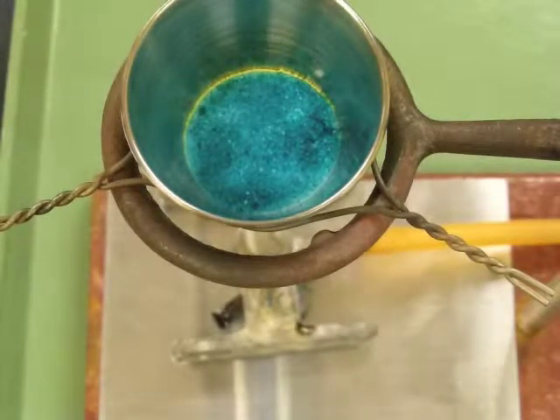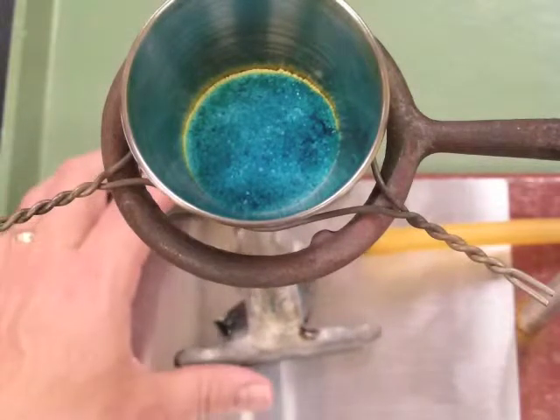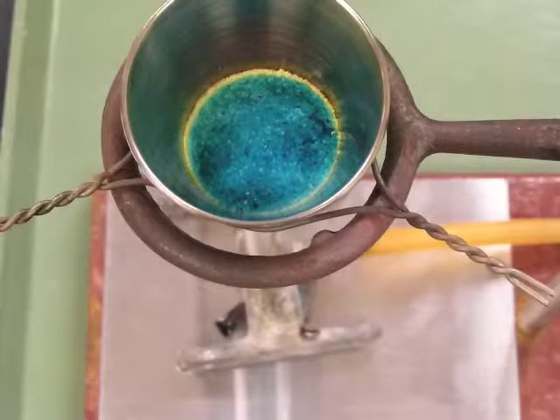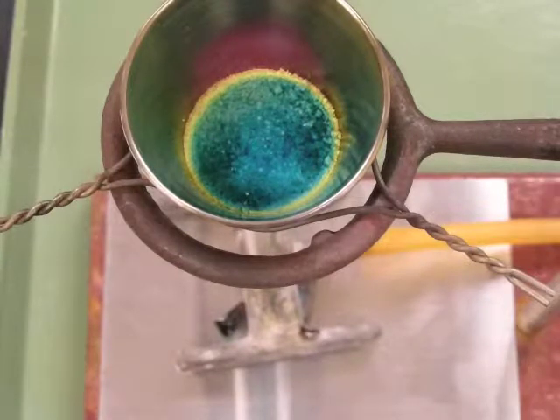Okay, so I'm going to put this substance in the crucible over the fire, and as this heats up, the water molecules will be driven out of the compound. And this one, since it starts with a color and it loses the water, it's going to change color very gradually. It'll start turning a lighter color, a yellowish, whitish color, and that will tell us that all of the water is gone. Depending on which substance you use in the experiment, you may or may not see a color change. If you use the white compound, magnesium sulfate, you won't see any color change because it's already white. But if you use the copper sulfate compound, which is a blue material, you'll see a change in color. It should turn a light blue, almost white.